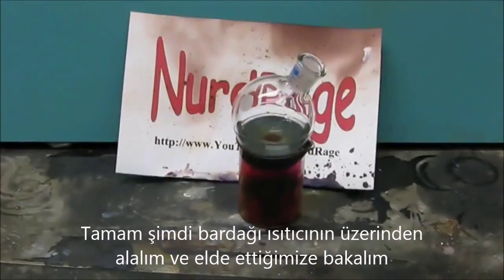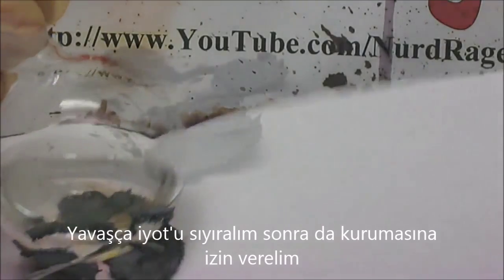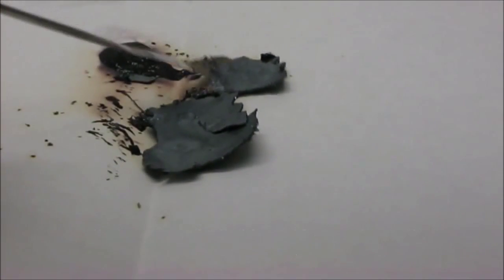Okay, let's take it off and look at what we got. So this is purified iodine. Simply scrape it off and let it dry. And now you have iodine.